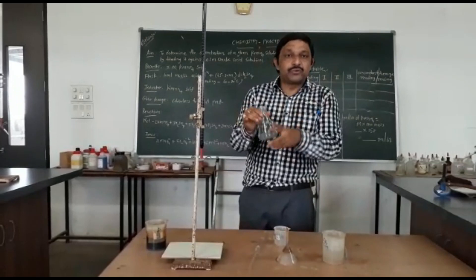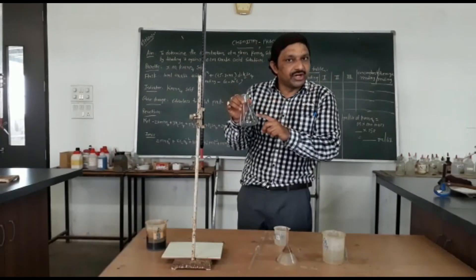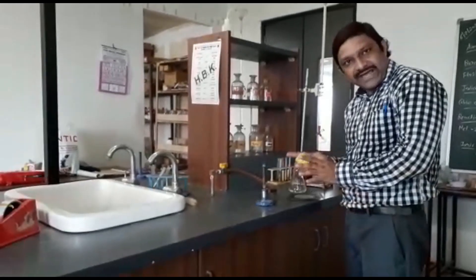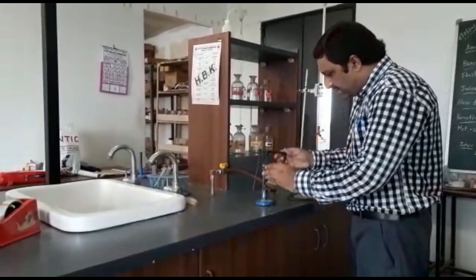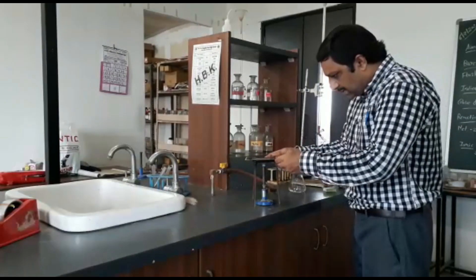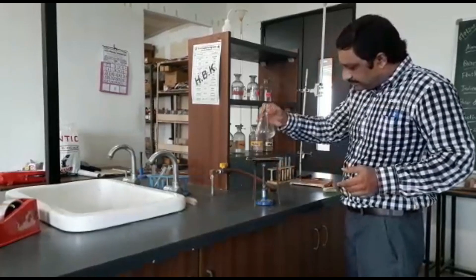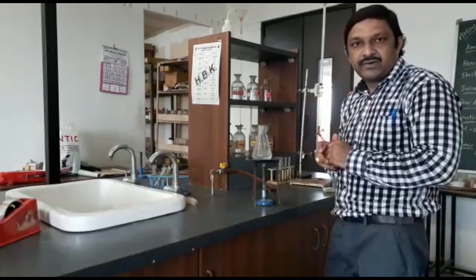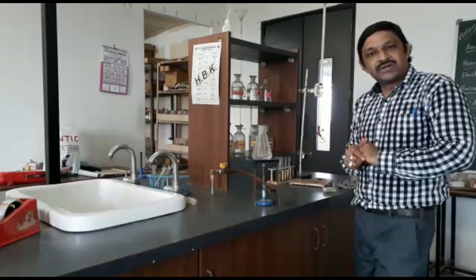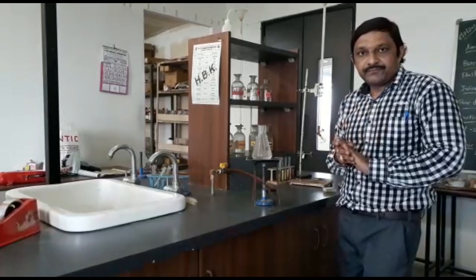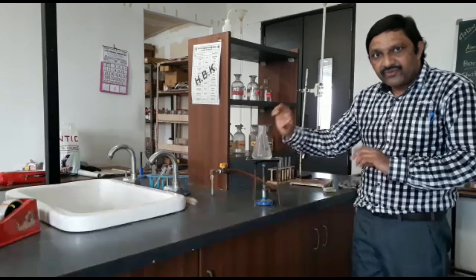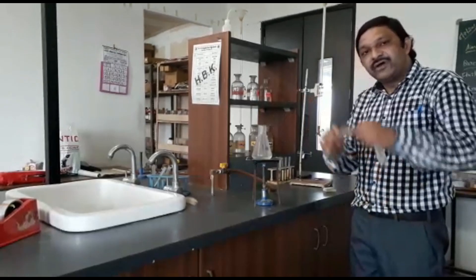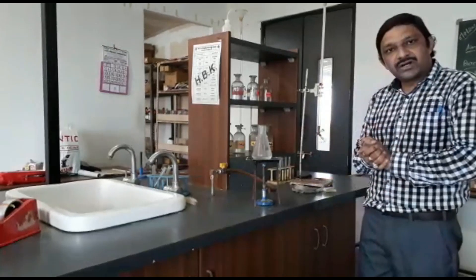Now you have to heat your conical flask solution up to 60 to 70 degrees centigrade. Here is your gas burner, here is your tripod stand — place it like this with the asbestos mat, and place your conical flask with the solution on top. Heat the solution. When vapour comes from the side, remove the conical flask using a handkerchief.